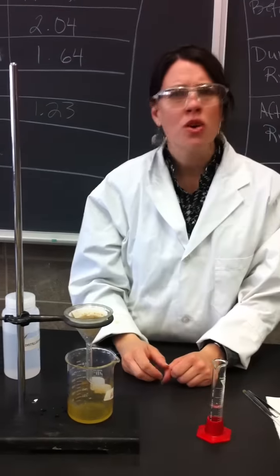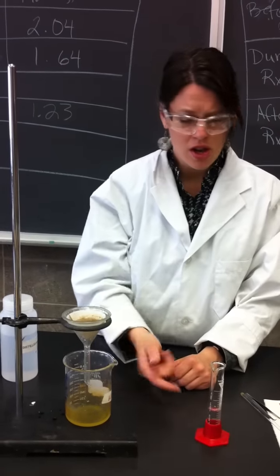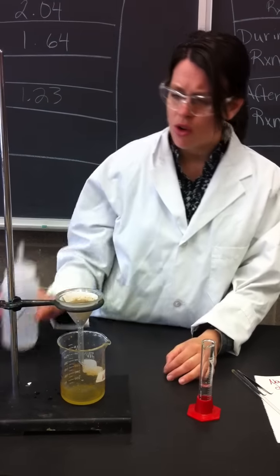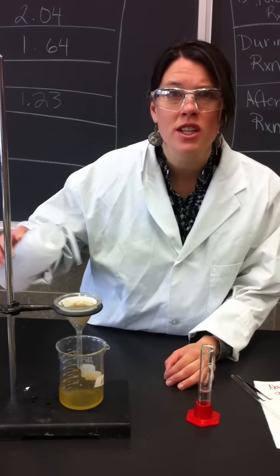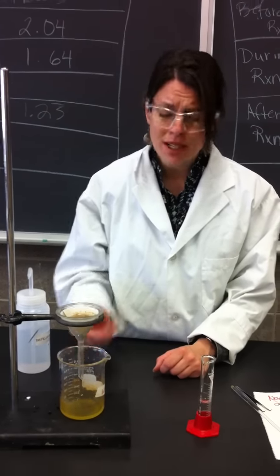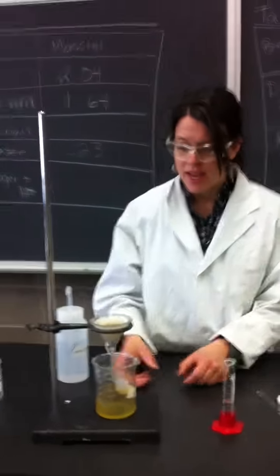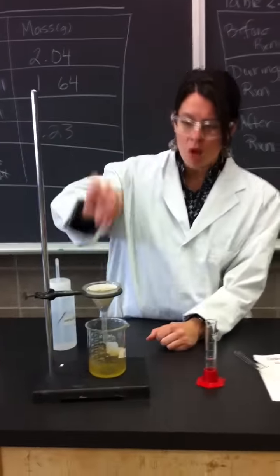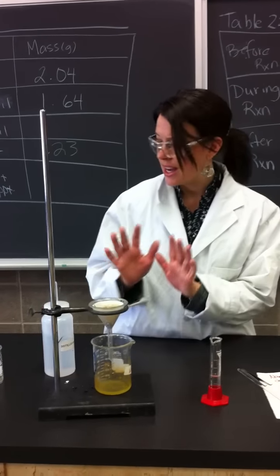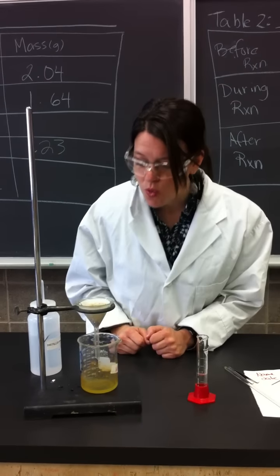And then after that, you're going to rinse it a couple times with distilled water. So you can measure distilled water to do three 10-mil rinses, or you can just use distilled water this way. Sometimes it depends how much time you have, because it's a little bit of a slow process. Okay, so drip, drip, drip, wash with acid, wash with distilled water. Near the end, you'll be like, oh, great.